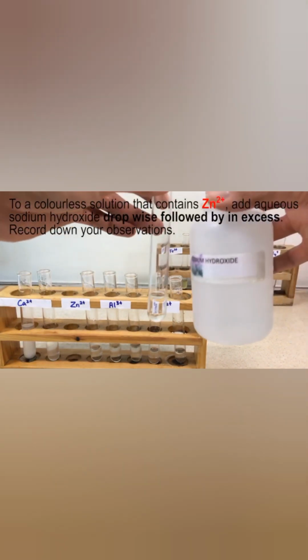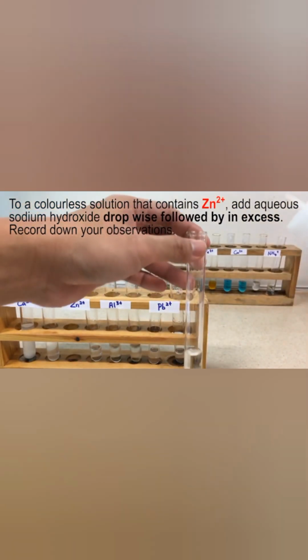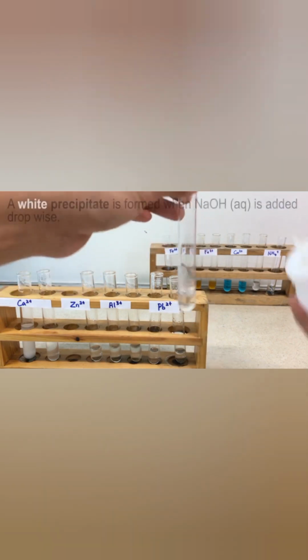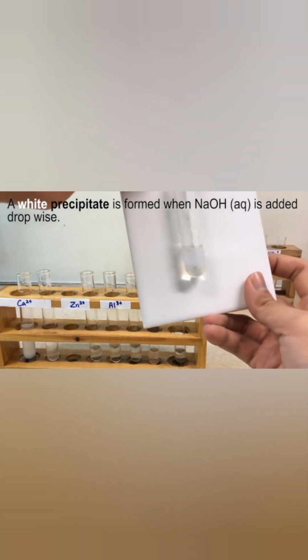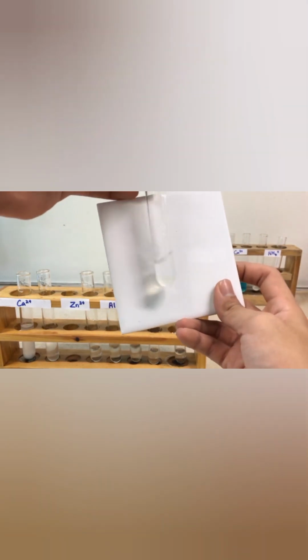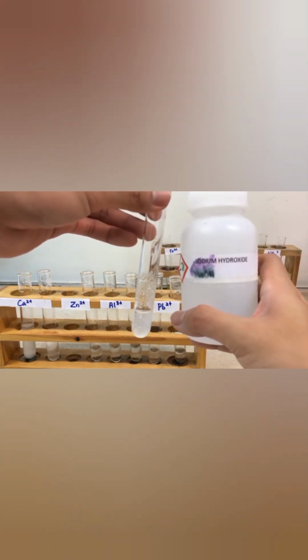Okay, let's go over to a colorless solution containing zinc. Let's add a few drops of sodium hydroxide and see what happens. A white precipitate is formed when sodium hydroxide is added in drop to a solution containing zinc ion.